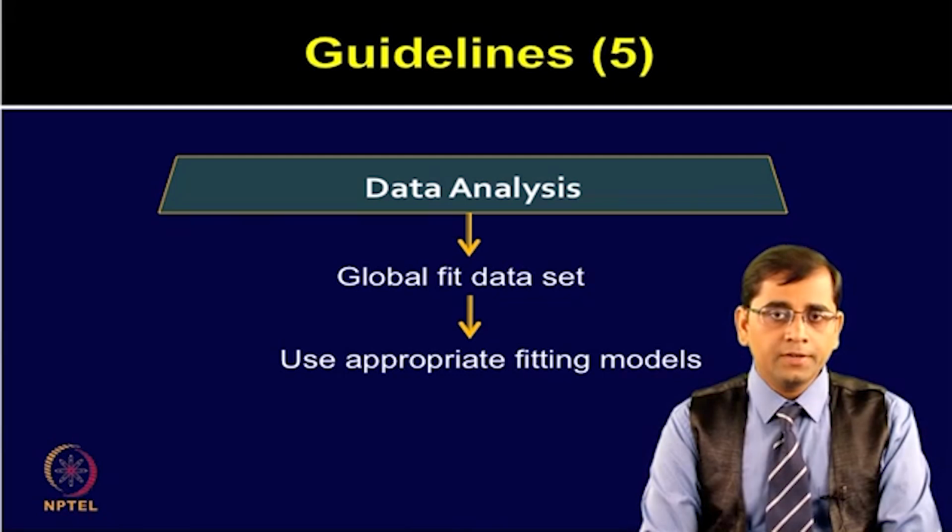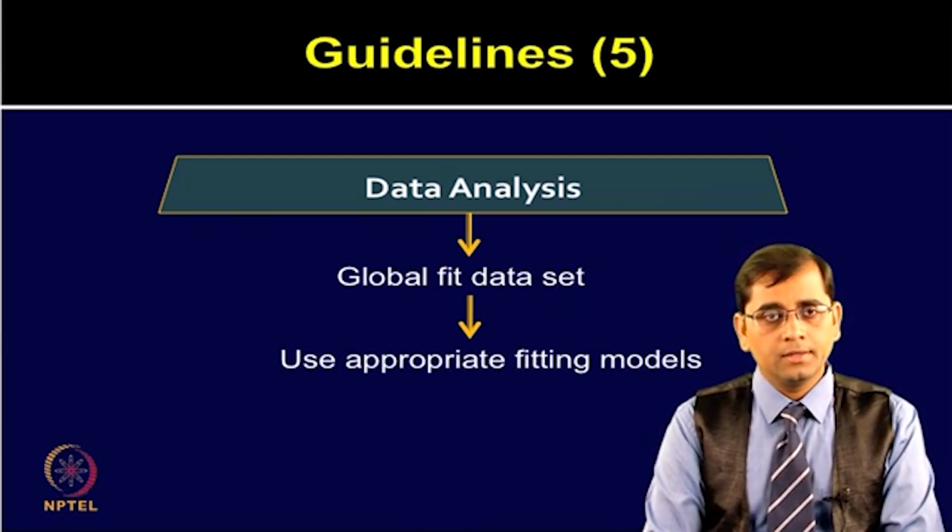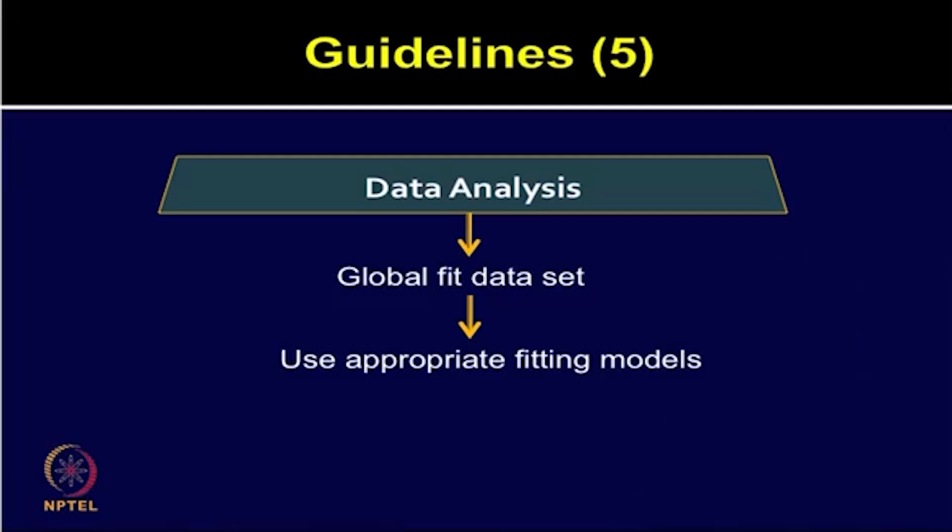Now, how to fit the data? The selection of appropriate fitting models is always very critical. The experiment must be designed accurately. As an example, for an antigen and antibody interaction, for an antibody being able to bind to two different antigens, it should be used as a ligand. An antigen should be flown over as analyte to study their biomolecular interactions. If binding data has to be correlated to interaction models, experiments should be designed critically to be able to fit the data by using appropriate fitting models.